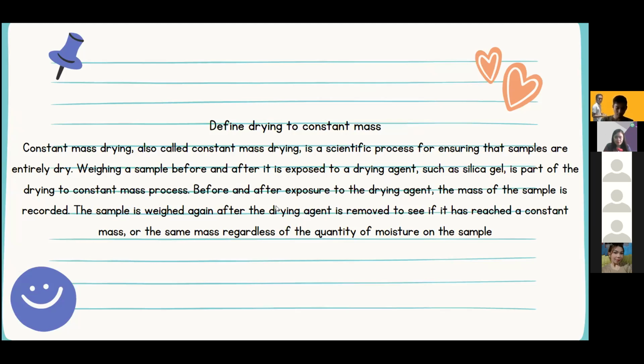In addition, heating the crucible and its lid to constant mass is done for a particular reason: there will be changes in weight that vary with temperature.